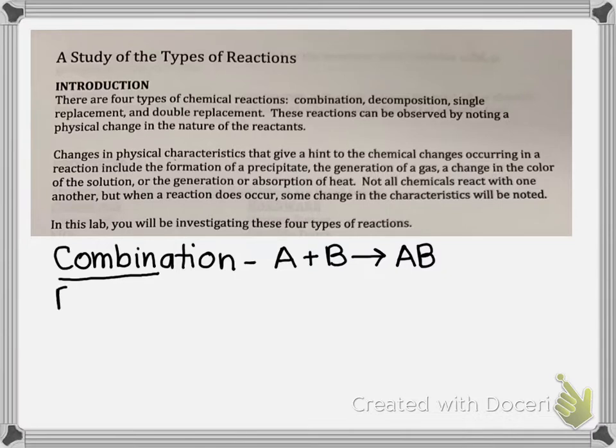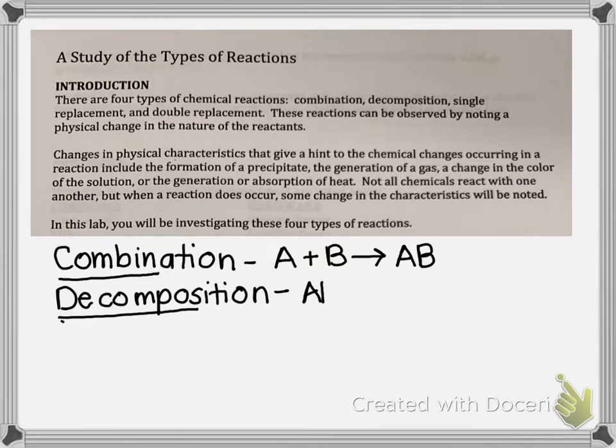We'll also do a decomposition reaction. And you can see in the name decomposition is the word decompose, which is breaking down. It's kind of the reverse of a combination. We'll start with one chemical and we'll break it down into its pieces using a Bunsen burner.